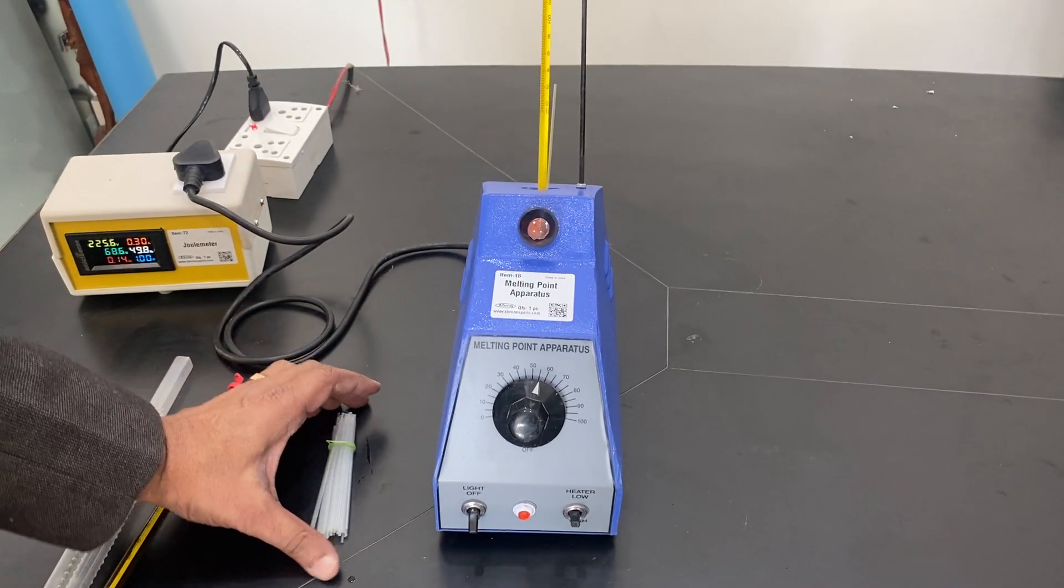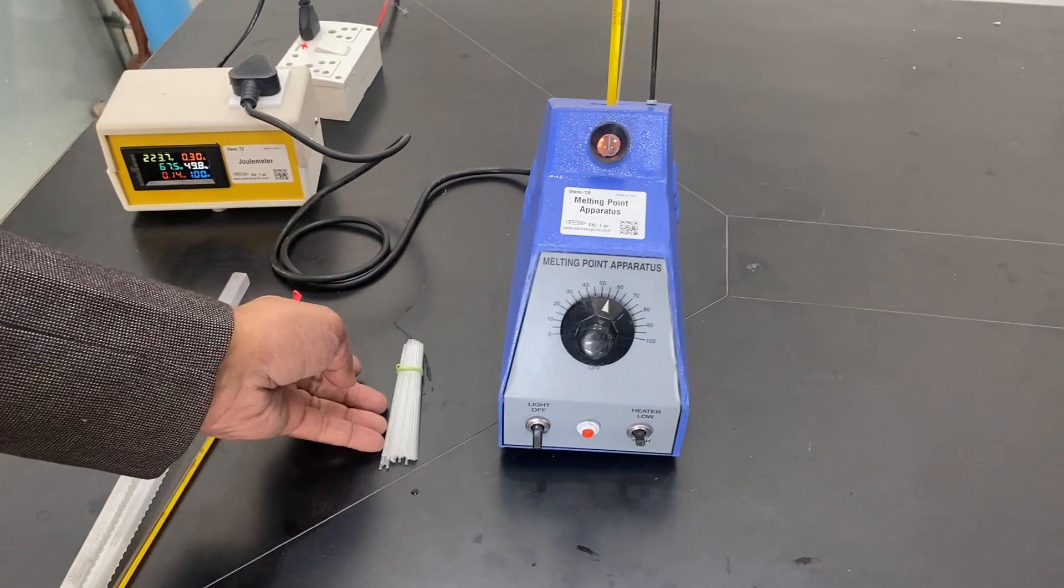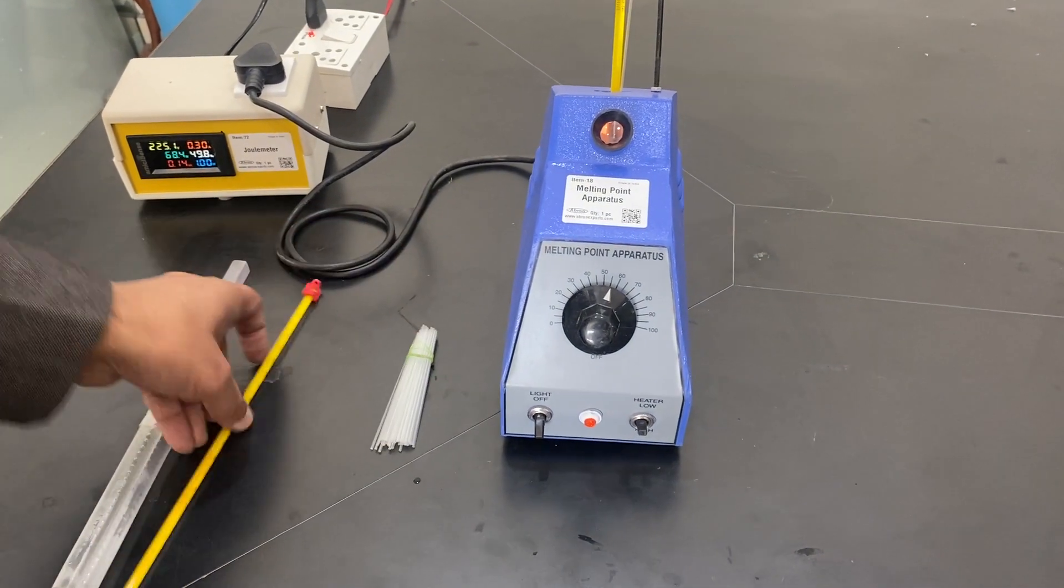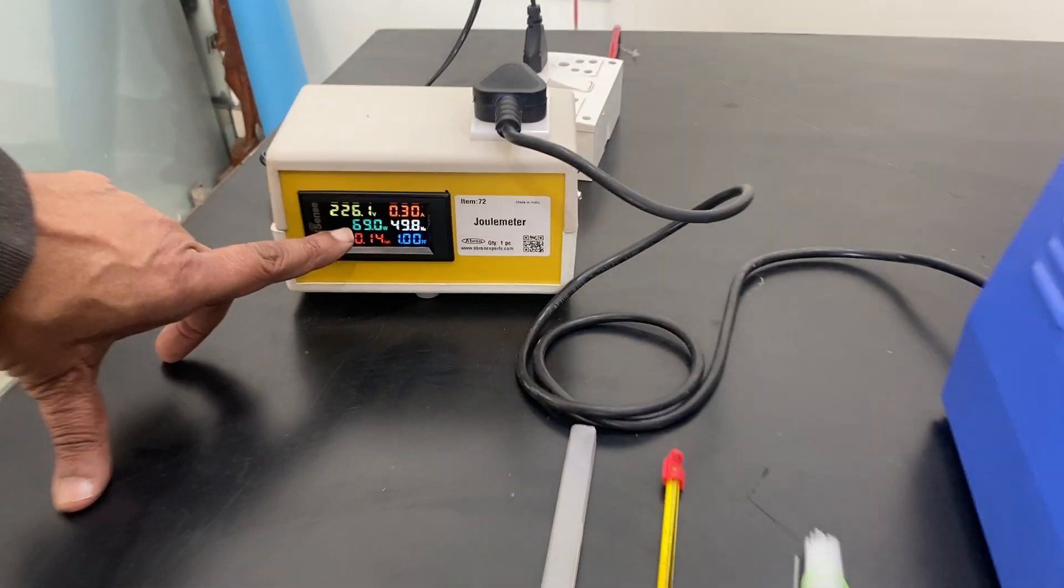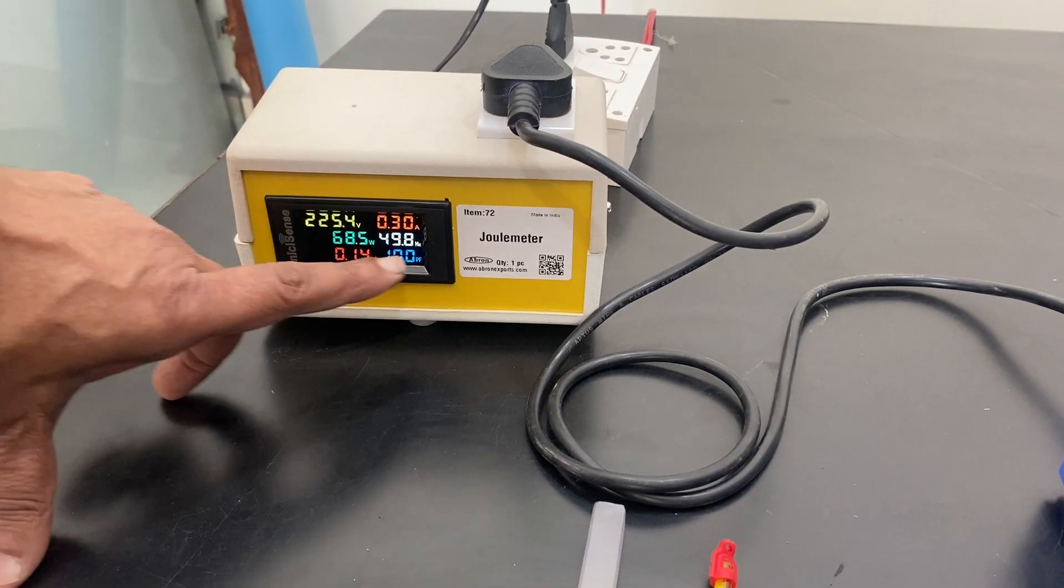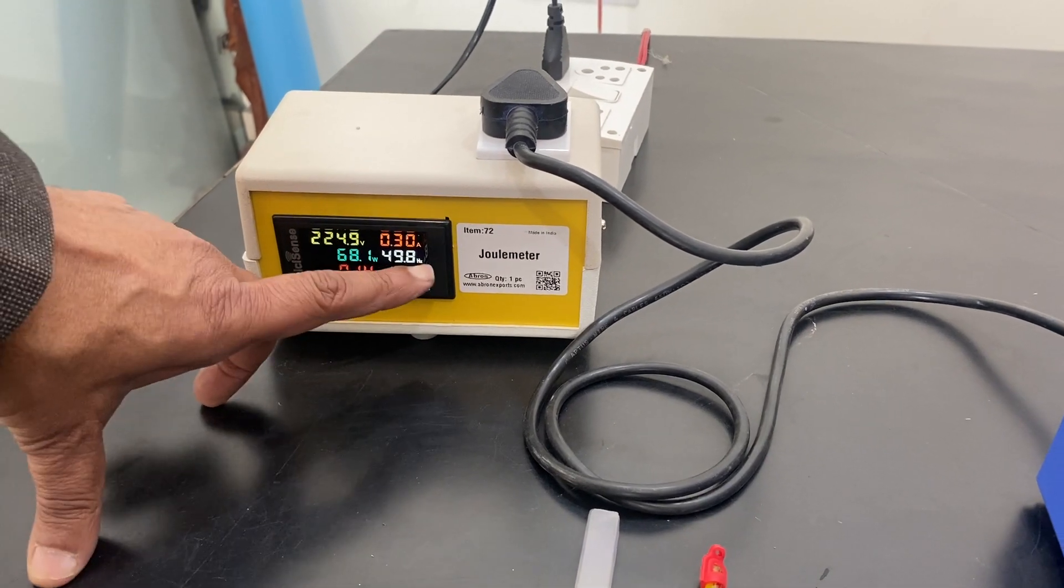We generally provide the capillaries, but it's not a part of the instrument. We generally give you 10-20 capillaries. Thermometers are also optionally available. It gives 70 watts, the heating capacity of the heater.